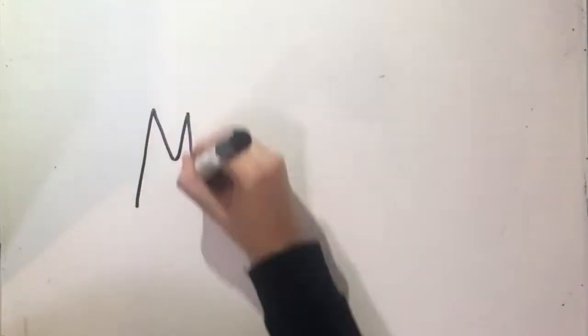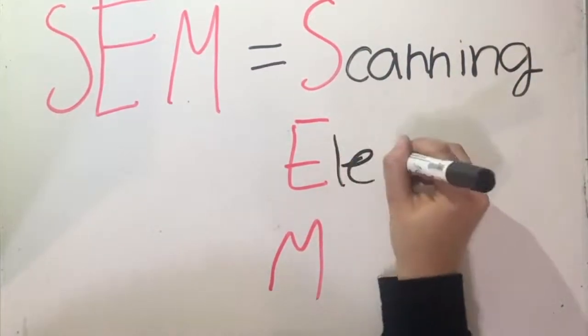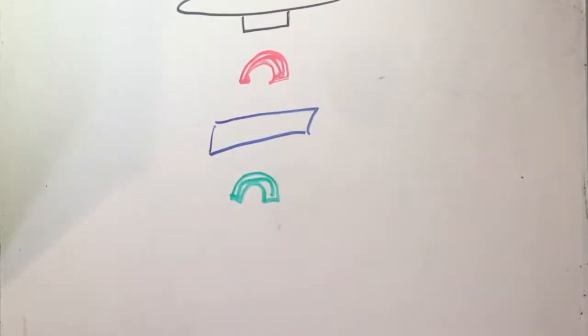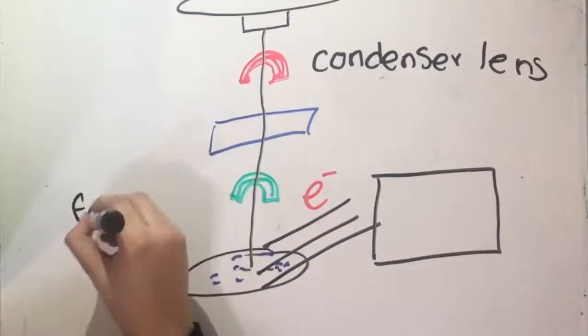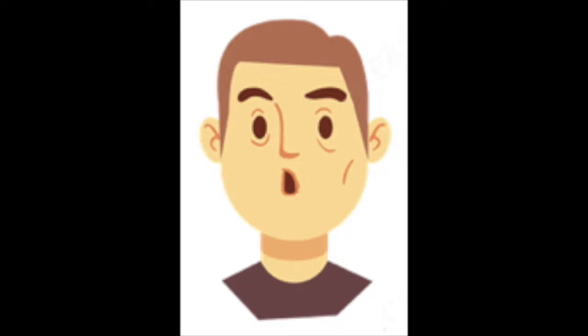Well, not only the molecular weight is important, but also the morphology. Another one? This is amazing! This can be analyzed through scanning electron microscopy. This characterization method employs a focused electron beam that interacts with the analyzed sample. This interaction between the electron and the sample generates an electron signal, which is shot back to a detector and with a mathematical correction transforms the electron pattern to an image of the sample. This equipment can determine morphology of a sample with a size from 1 to 100 nanometers. 1 nanometer? That's really small. Is that all you can achieve with characterization?